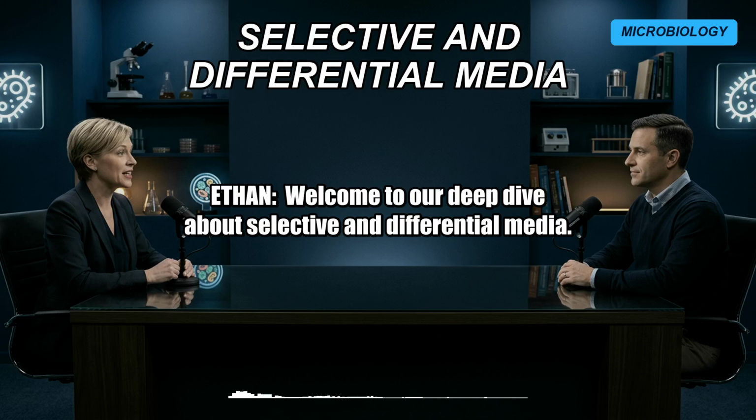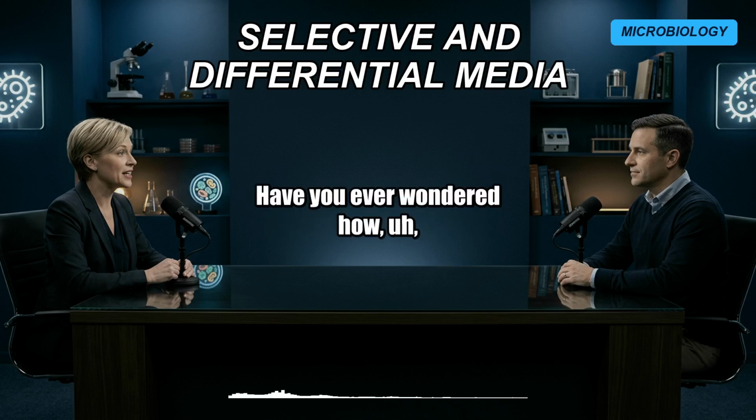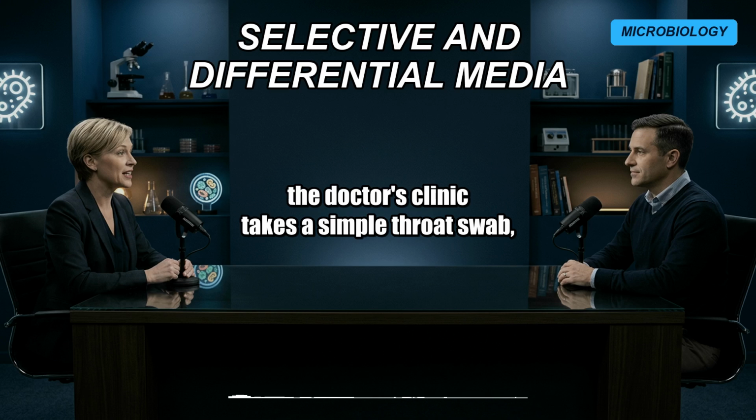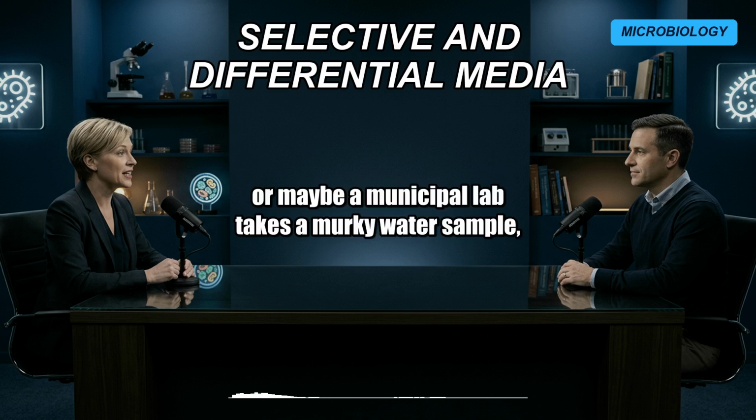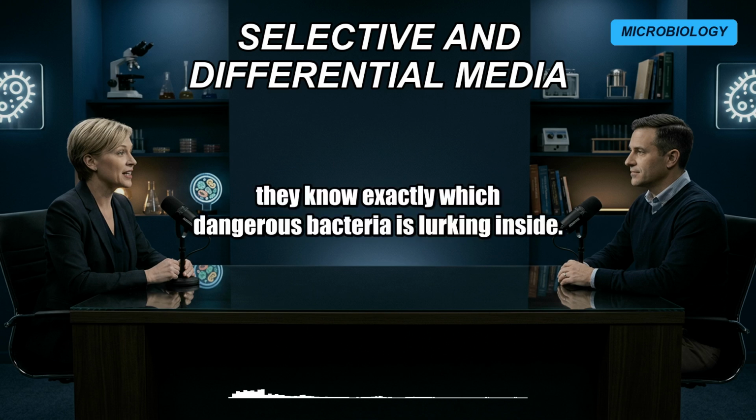Welcome to our deep dive about selective and differential media. I want to just start by asking you a question. Have you ever wondered how a doctor's clinic takes a simple throat swab, or maybe a municipal lab takes a murky water sample, and then somehow, within a single day, they know exactly which dangerous bacteria is lurking inside?